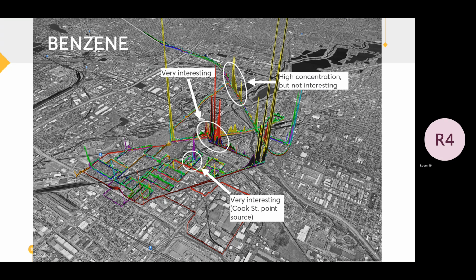On the other hand, hotspots that are really interesting show enhancement of the target compound day after day after day. This one here is basically in the middle of the refinery, where we drive through the refinery on public roads, which is pretty incredible. And this is an unexpected point that we'll take a closer look at. For spots where we saw enhancement, something that we communicate to our customer.